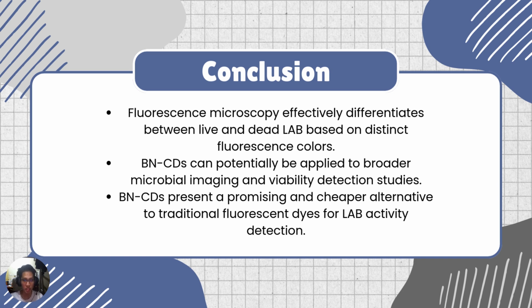Overall, this study successfully demonstrated that BNCDs combined with fluorescence microscopy offer a novel and reliable method for detecting bacterial activity. This technique proves a cost-effective, non-toxic, and stable alternative to conventional fluorescent dyes, with broad applicability across different biological fields. Future research should focus on refining BNCD formulations and testing them in real-world industrial settings to maximize their impact.